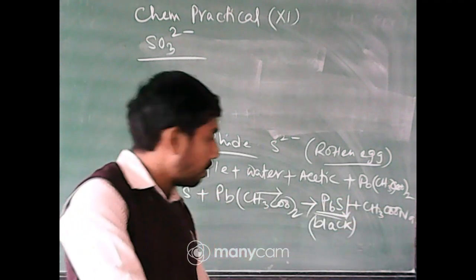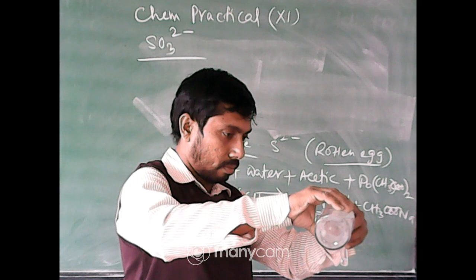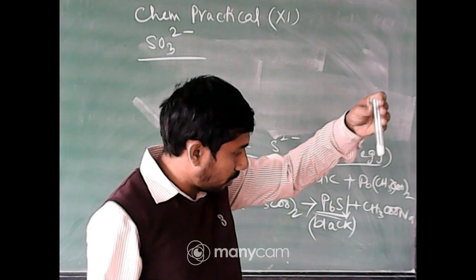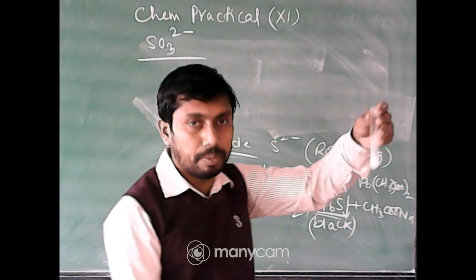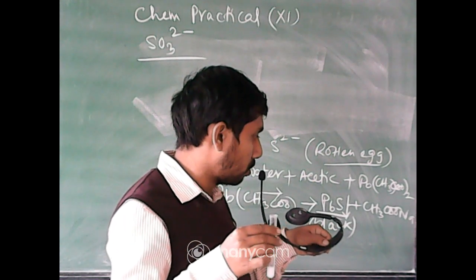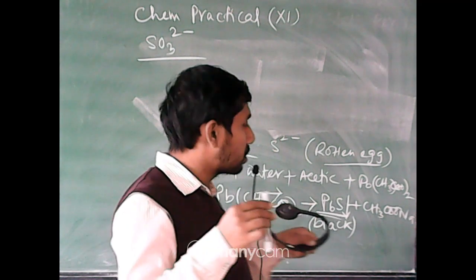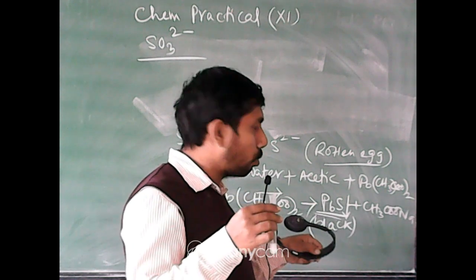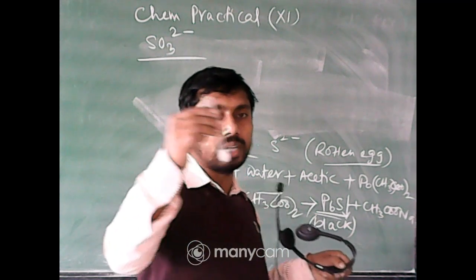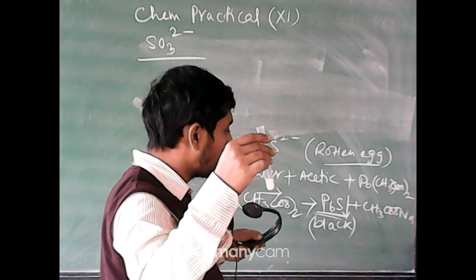And then barium chloride is added. Just see the white PPT here. You can see the white PPT here. Yes, this is the chemistry. This you will get from any book, from net. But this is to show you what the observation is here. So first see it, and see the chemistry responsible for that.